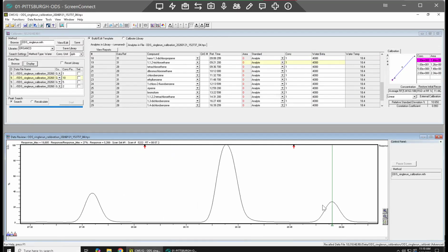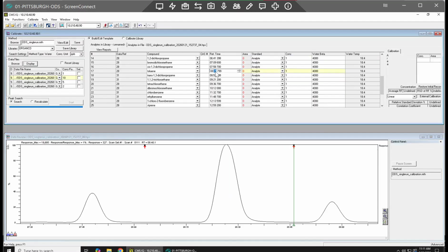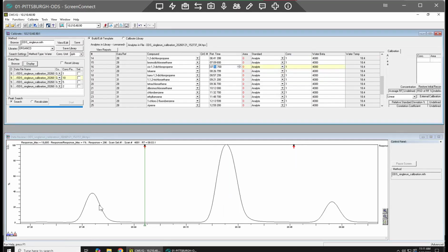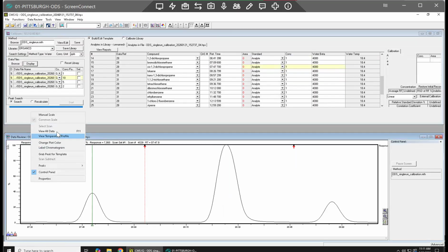Or is it the one I just... okay, 857, trans-1,3. So this is going to be 857. Next one, toluene, 826. And this one here, 747. So we're before toluene. So cis-1,3. Oh, shoot, sorry. Closed. 747. Okay, I guess I'm going to do them all.